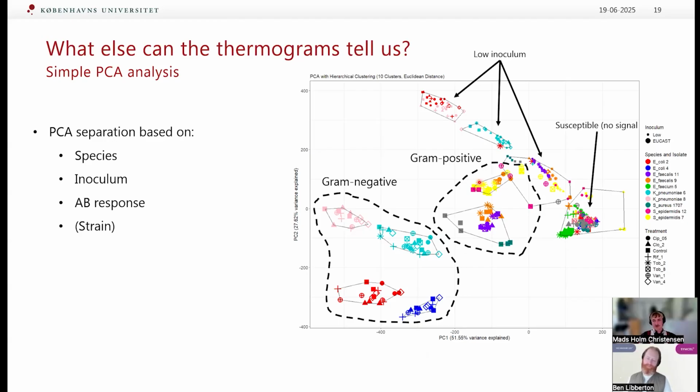So with few data points, your gram-positives start to look more like each other if you do an analysis like this, and there's a bigger difference between the gram-negatives. But still, very exciting that you can go down to strain level in some cases within the same species.